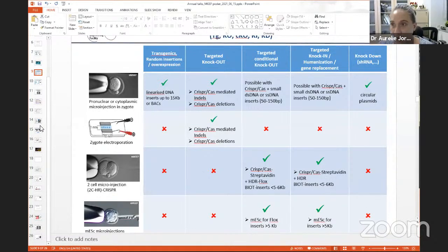So in order for that to work, we need to make sure that the female does not carry the pregnancy of her own embryos, right? So the way this is done is that we mate, in mice, the females that are in estrous cycle, and we mate them with vasectomized males.